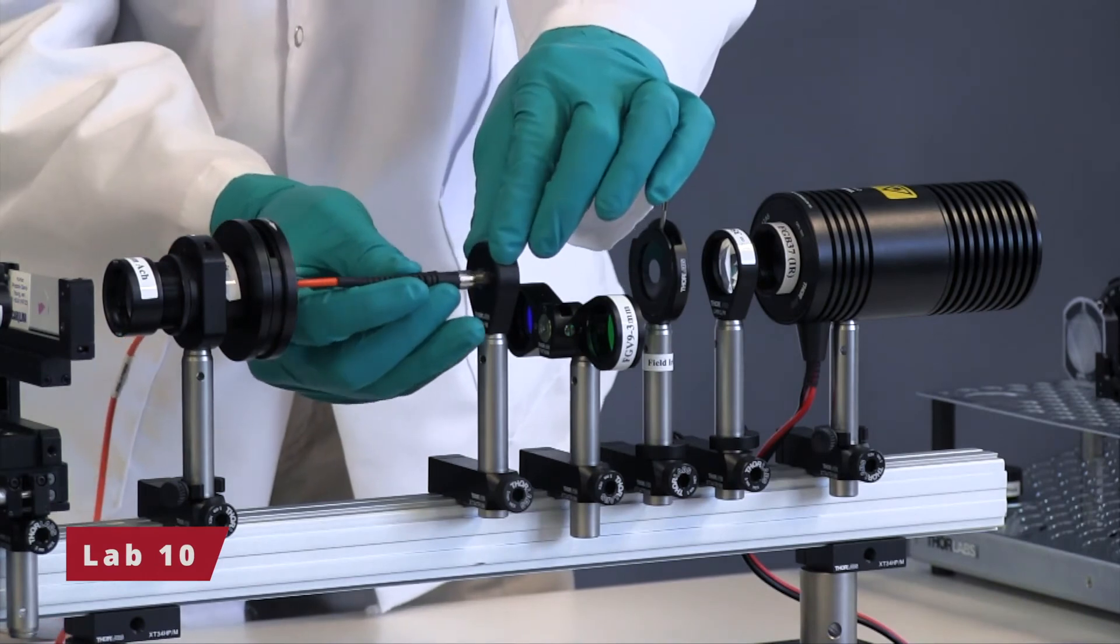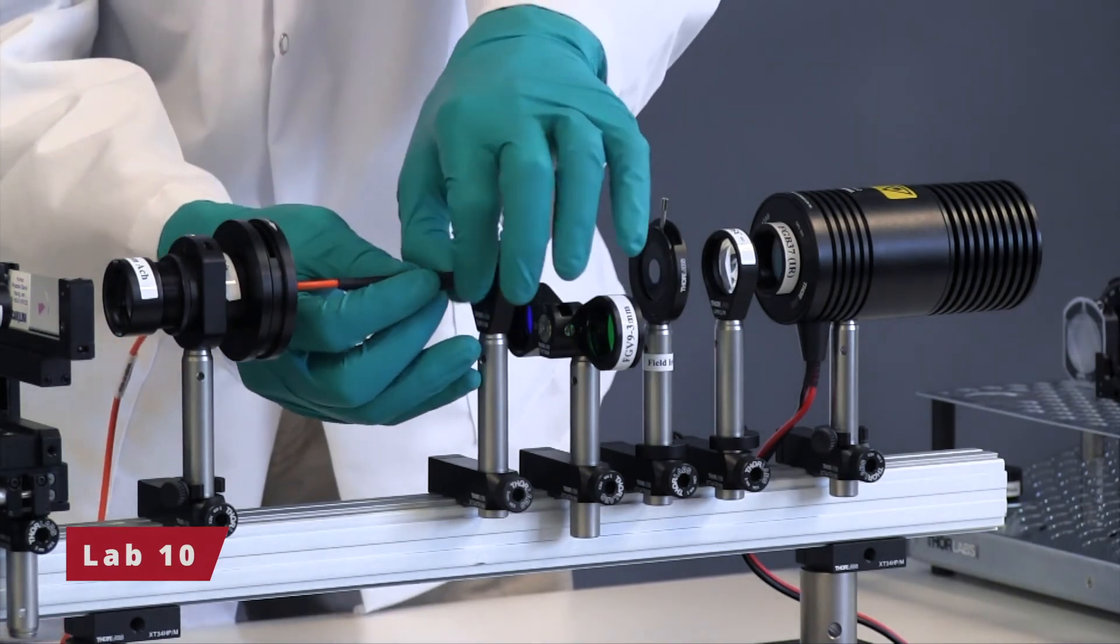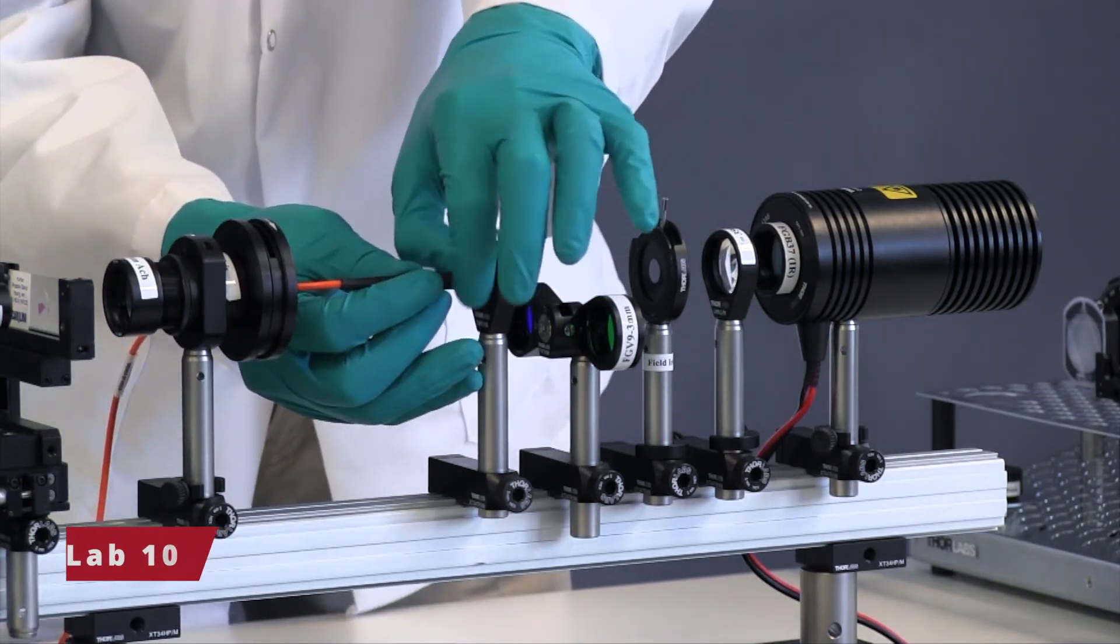Lastly, in Lab 10, students investigate filter spectral behavior and its effect on fluorescence imaging.